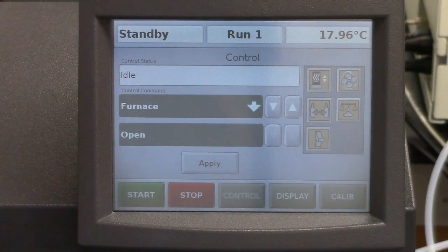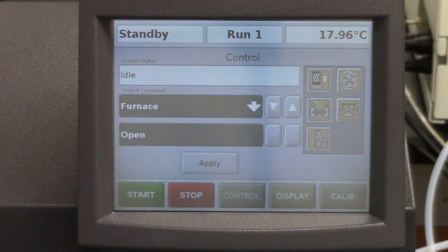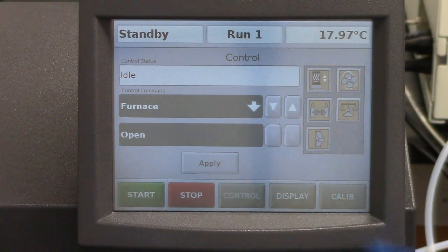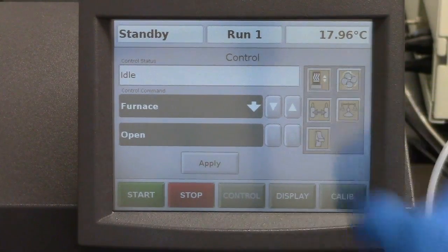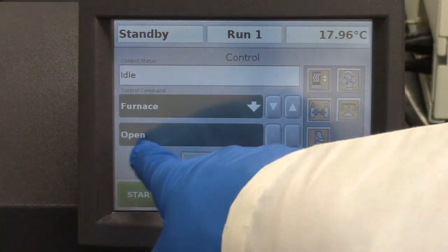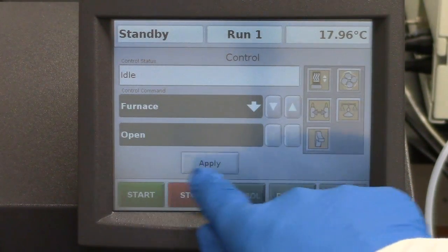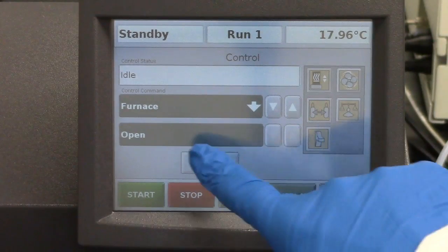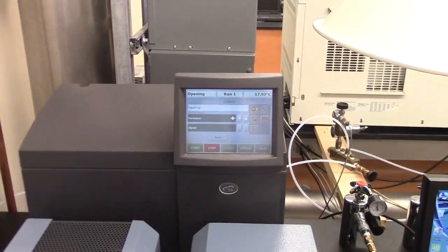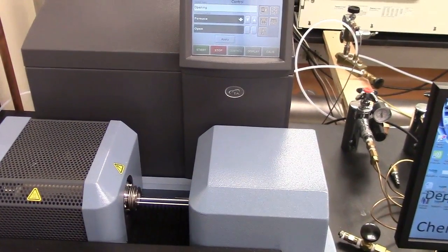Here is the control screen for the TGA instrument. What we'll need to do now is open the furnace. To do that, you simply press that button there, and then see here it says open. So we want the furnace to open. Hit apply.